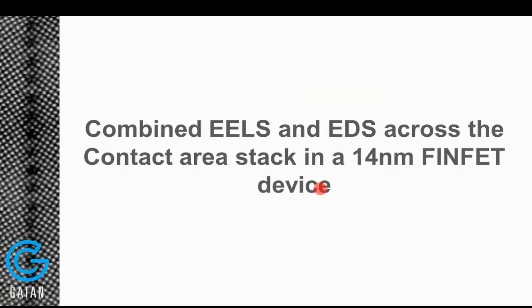So now we are ready to switch to the second example. Basically, looking at, again, acquiring EELS and EDS analysis across the contact area stack, in this case in 14 nanometer FinFET devices. I think this sample was probably prepared from a smartphone currently present in the market. So this is something that you actually have in the market right now.